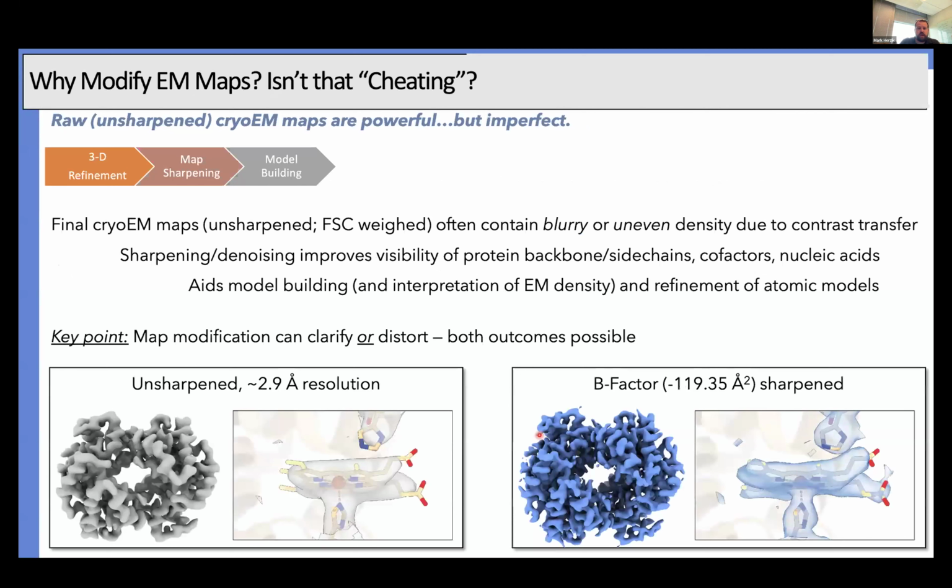And so when we think about cryo-EM data, it's very different from crystallography because at the end we get an EM map. The EM map itself has excellent phases, as we've heard. Amplitudes sometimes aren't all that great, but the map is pretty invariant.